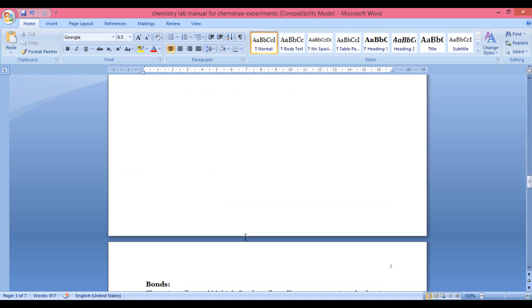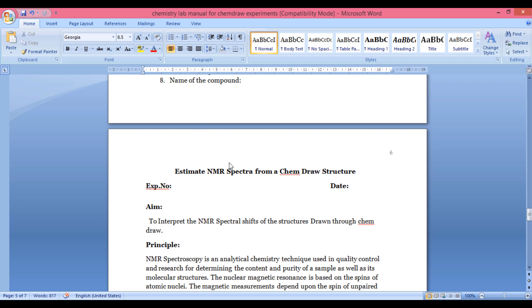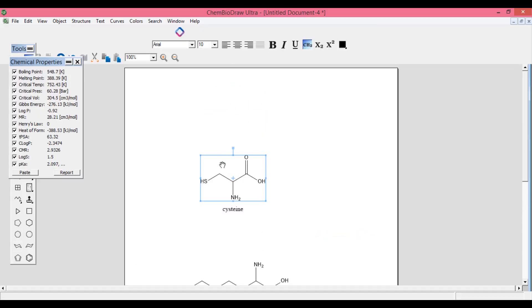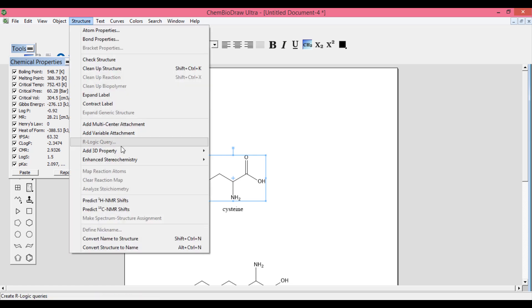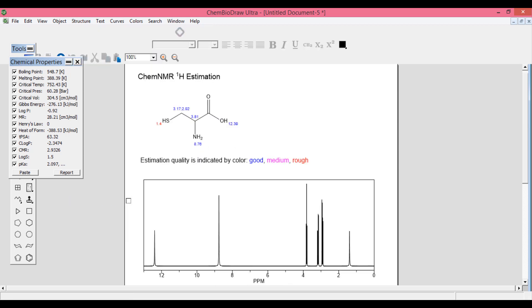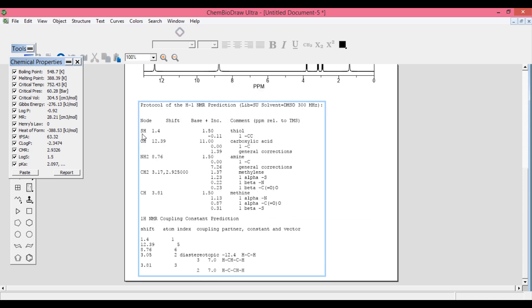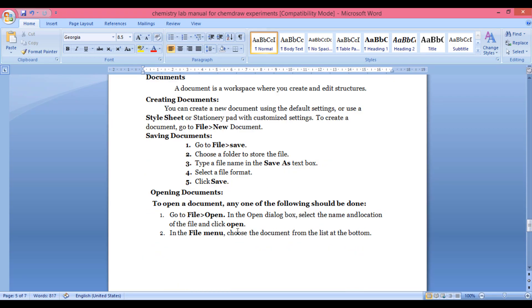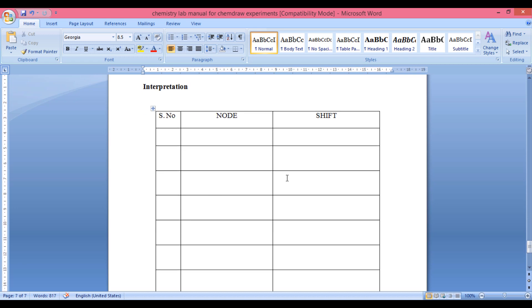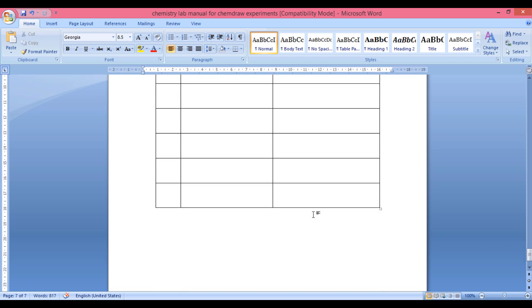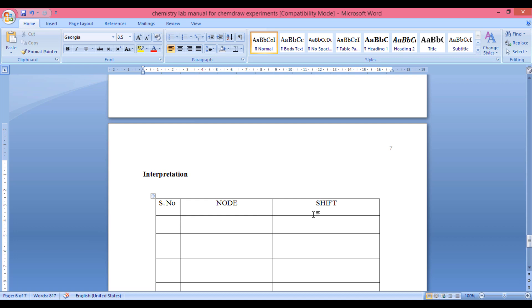Now let us move on to the next experiment: computing the NMR spectra from the ChemDraw structure. Go back to the selected structure, go to the Structure tool, and select 'Proton NMR Shifts.' You will get the proton NMR shift of the selected compound. Here you can find the node and shift, which is the experimental part. Record the node and shift values and carry them over to your next experiment. This software has many more facilities, but this video is limited to this scope. Thank you for your patient listening.